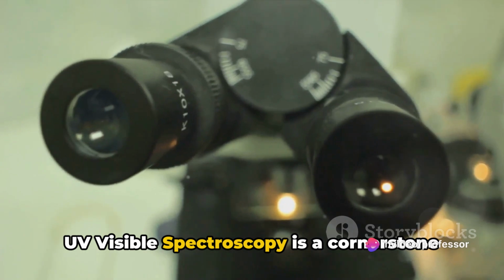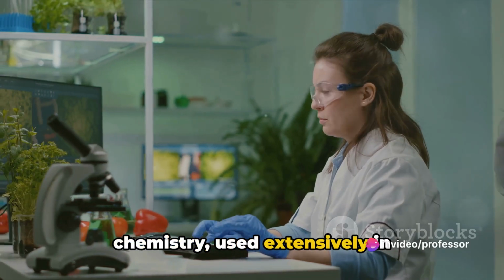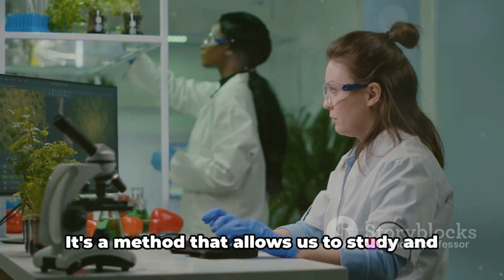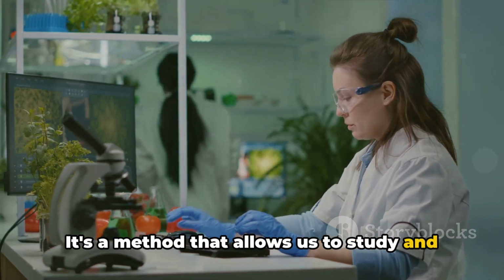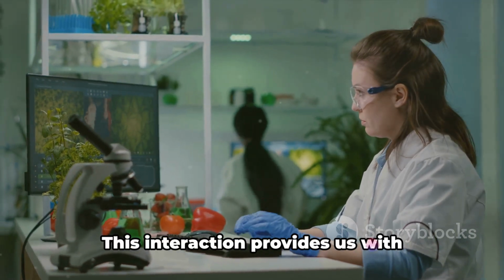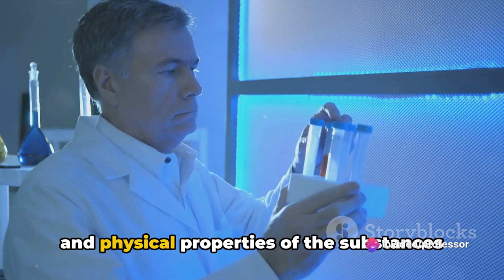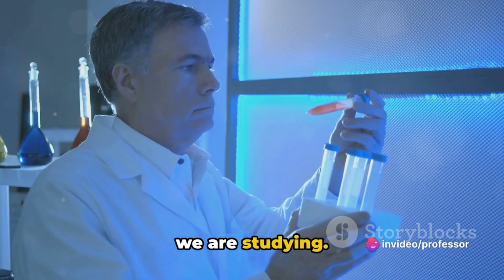UV visible spectroscopy is a cornerstone technique in the world of analytical chemistry, used extensively in laboratories worldwide. It's a method that allows us to study and analyze the interaction of ultraviolet and visible light with matter. This interaction provides us with valuable information about the chemical and physical properties of the substances we are studying.